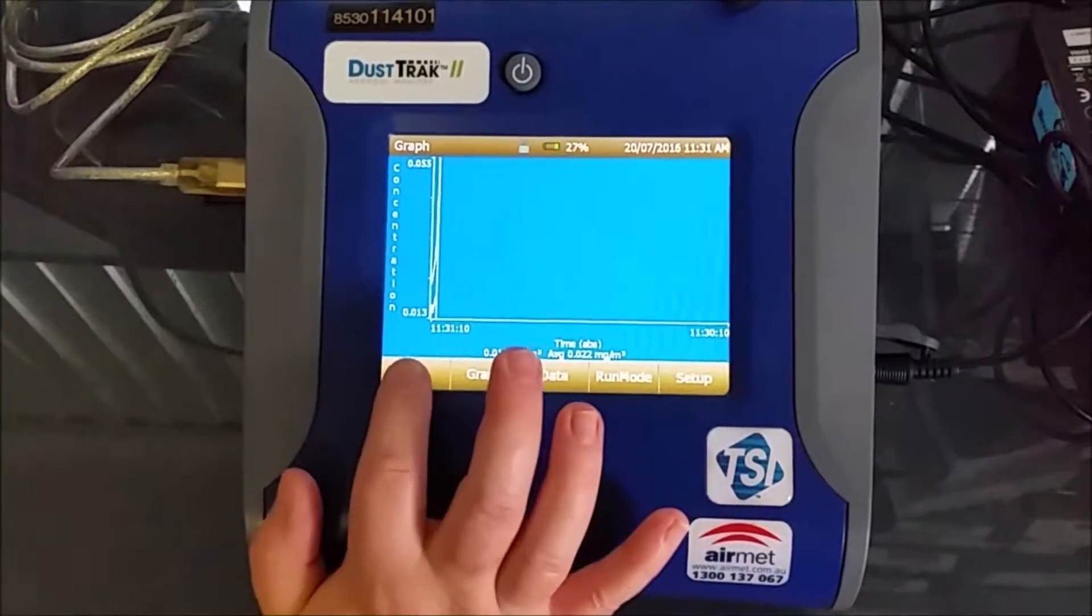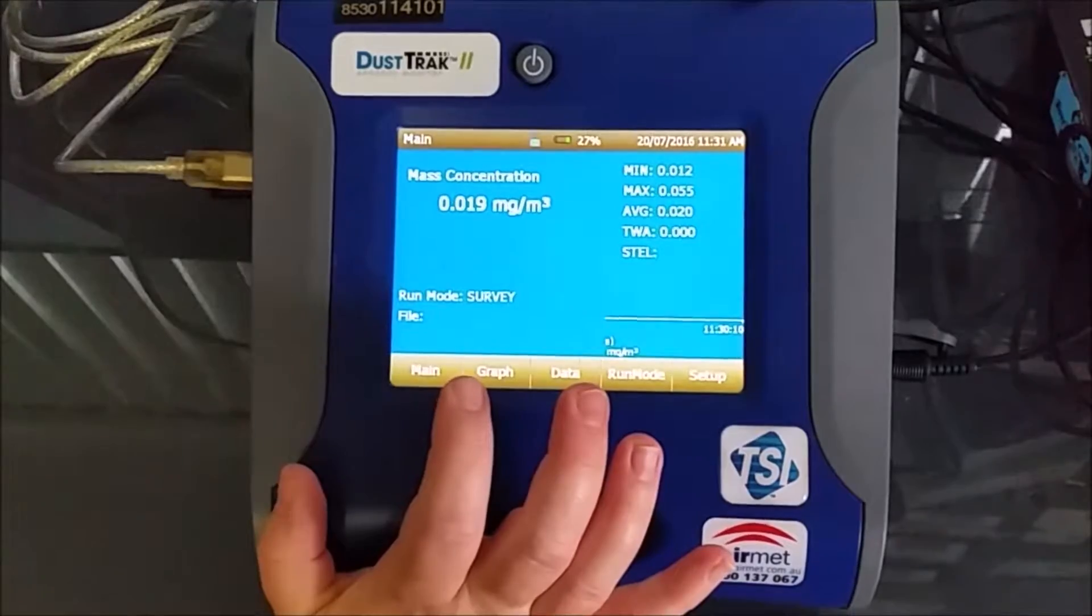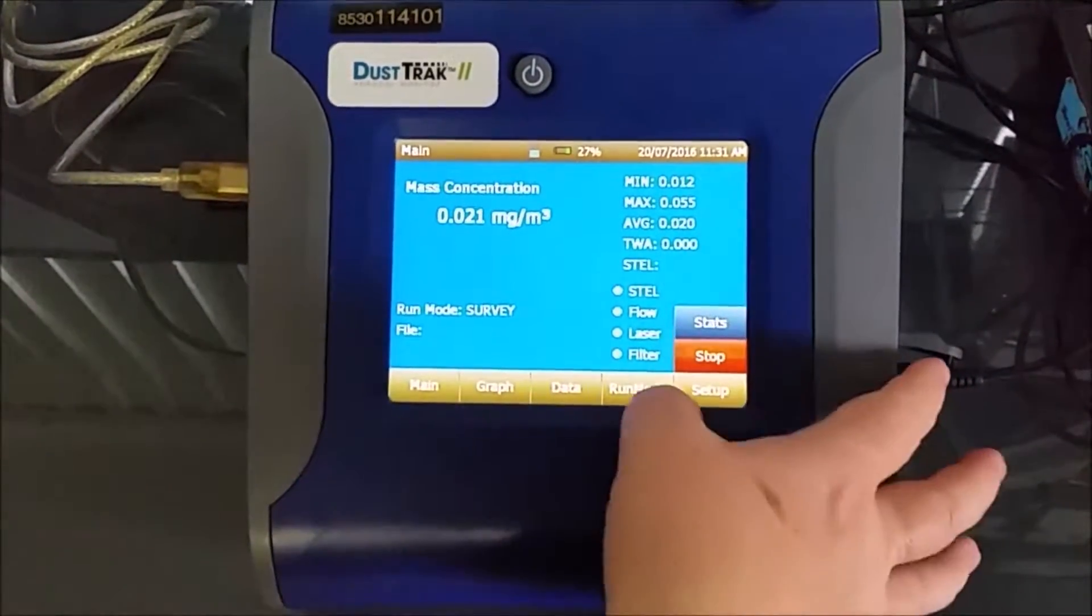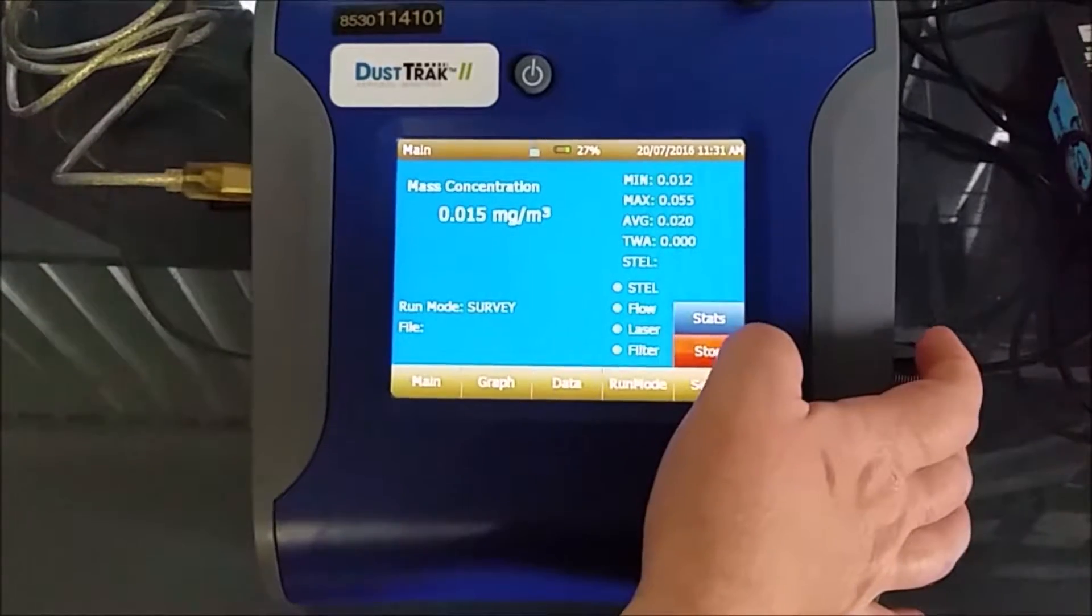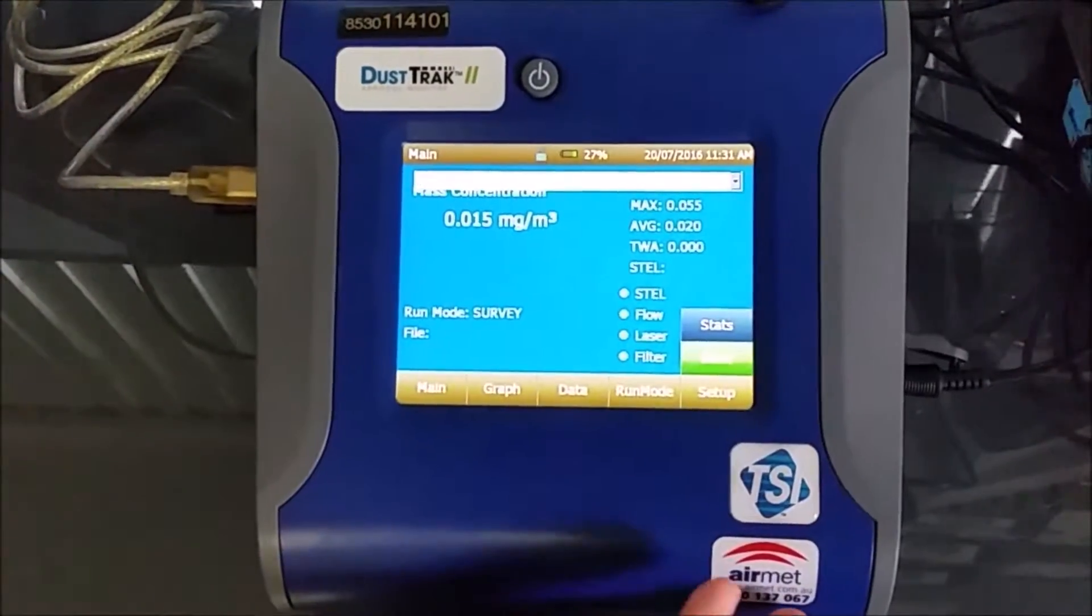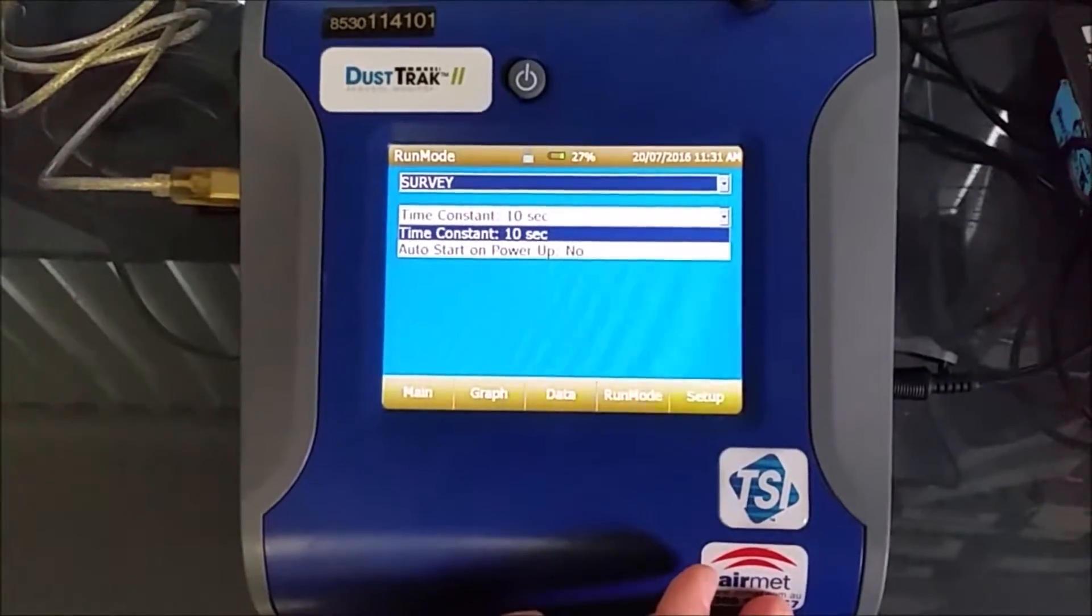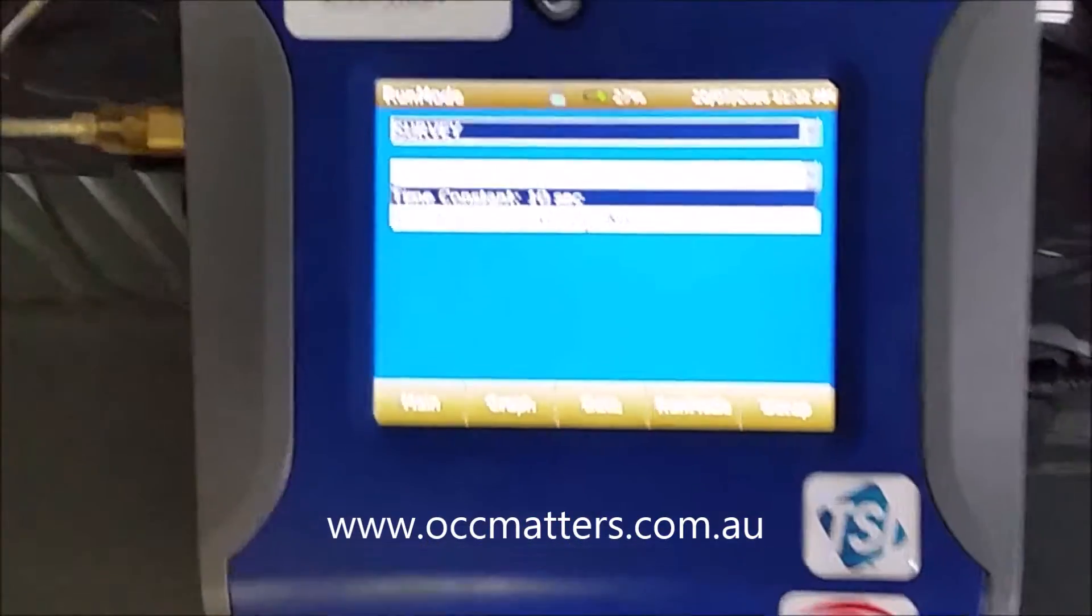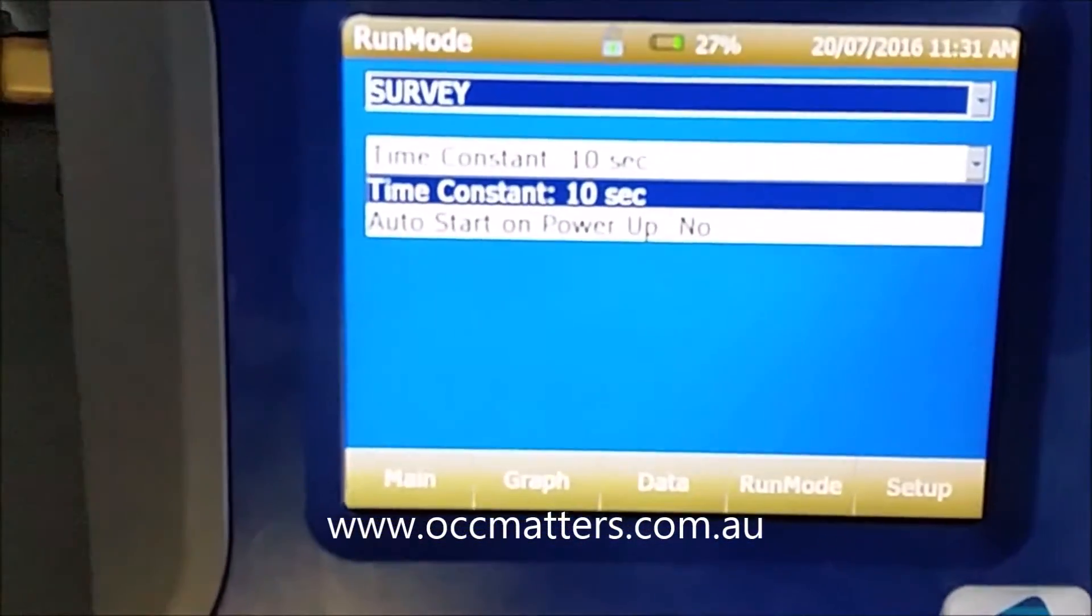We can go back to the actual main menu. Just stop, because it's quite noisy. With the run modes, you've got different run modes. At the moment, as I said, it's in survey mode, which means it's taking a sample every 10 seconds and it's not actually logging and saving the data.